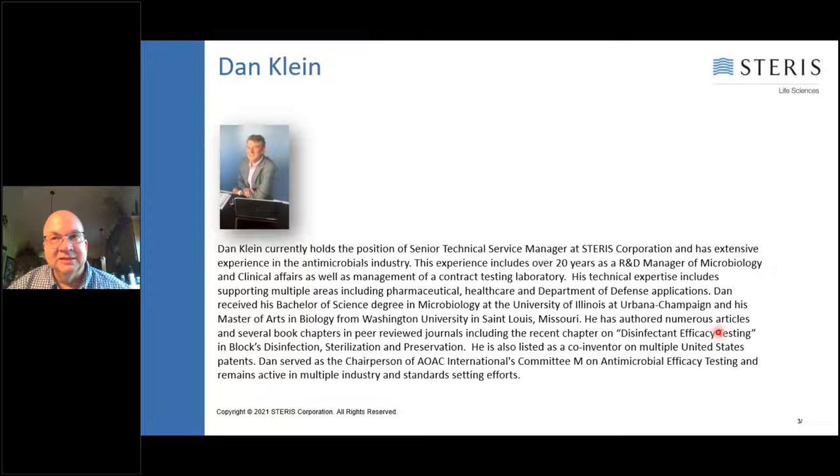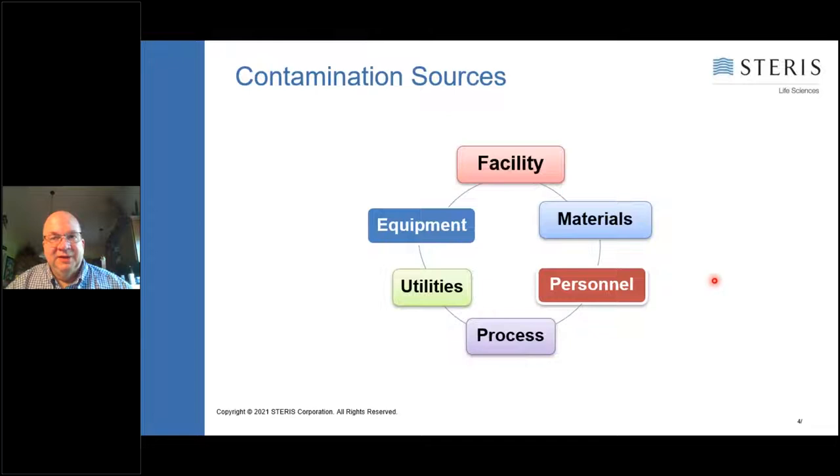I wanted to start off talking a little bit about contamination in the clean room and where it comes from and why this is such an important topic today. First off, you have your facility, so your facility design, the age of your facility. Over time, things like the ductwork and the flooring, when you have epoxy, vinyl, or terrazzo flooring, that sealant layer on the floor breaks down. And as the facility ages and gets up around 20 years of age, you start to see more and more contamination from your aging facility. So that is a big source of the bioburden over time in the clean room.